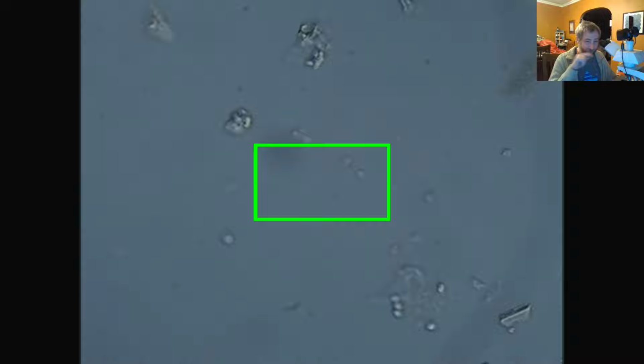So they're kind of interesting, but one of the things that happens when you're looking at a bunch of really small things is that when you have some of the bigger small things, they're usually kind of rare. So that's a pattern that's pretty common. So the really big things that I was looking for were actually a bit of a hunt. I had to go through the whole sample and find just a couple of them.